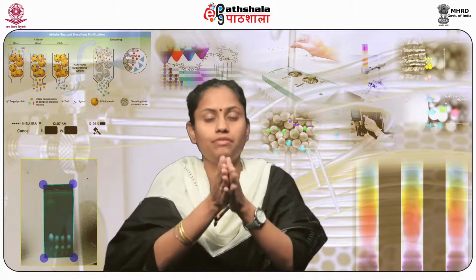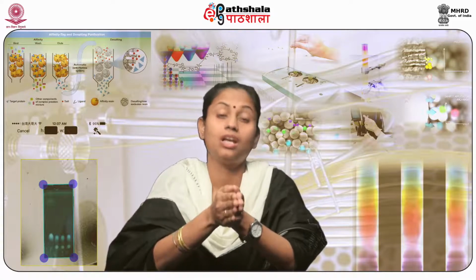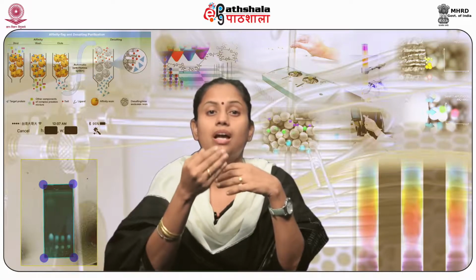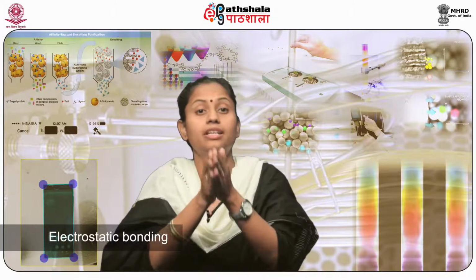After knowing about the different types of stationary phase and mobile phases that are used in ion exchange chromatography, it is very necessary and important to know how to optimize an ion exchange chromatograph. We have already discussed the electrostatic bonding that greatly affects the binding of ions to the stationary phase.